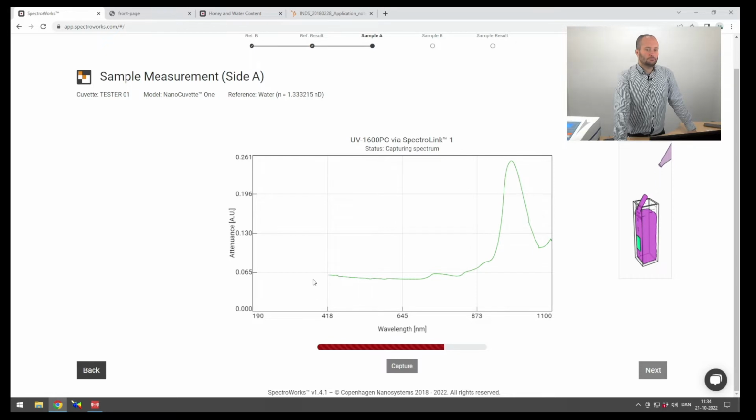Just to comment from our side on instruments. I see you're working 190 to 1100. For this particular application, that would typically be the USB 2000s and later ones. So yes, it would be quite a bit quicker than what you're using now. And also quite adequate.